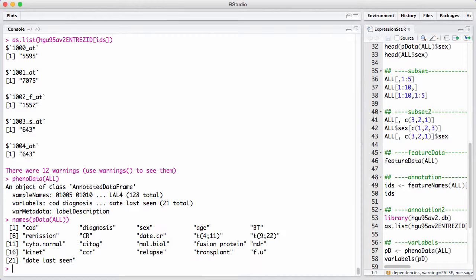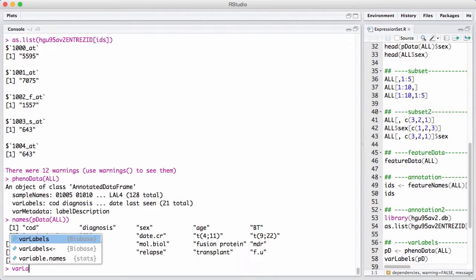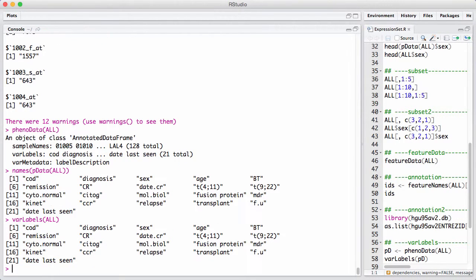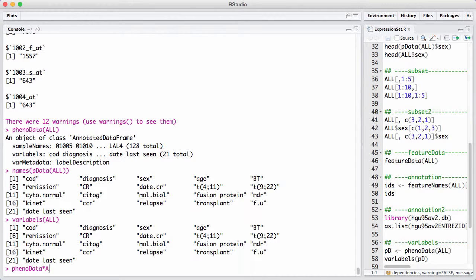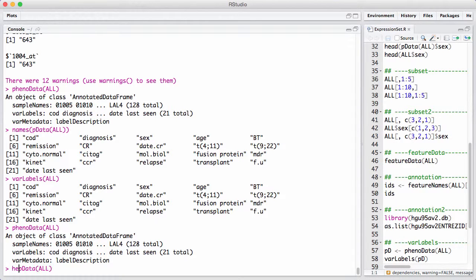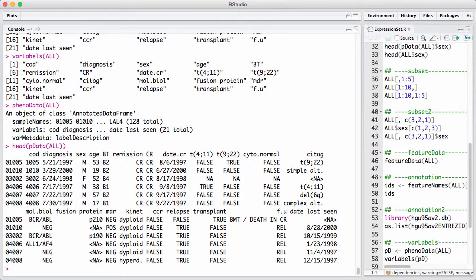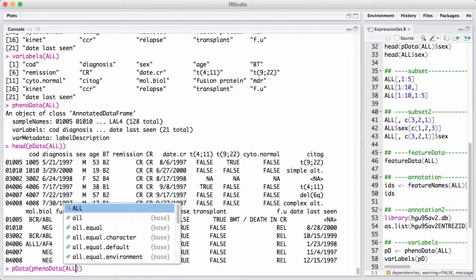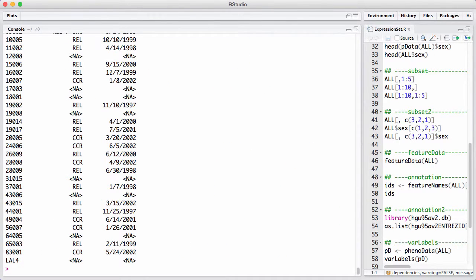That really was a mixture of a data frame and something called var labels that contains information about, in this case, not a lot of information, but could contain information about what was in different columns. So, this is a little bit of historical interest. This is in order to illustrate that phenoData of ALL is not the same as pData of ALL. And that phenoData actually contains the pData slot. We can say pData on phenoData of ALL, and we get back the full pData data frame.